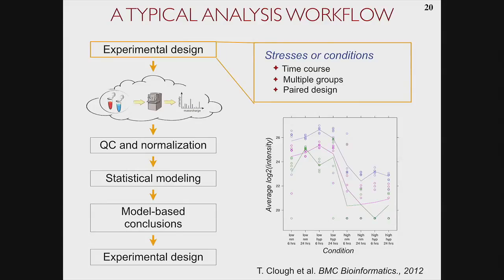And this is the overall run-through of how MSstats works. So, of course, the first important part is the experimental design, right? And before we do anything, we need to actually convince ourselves that we're interested in testing, as opposed to class discovery or class prediction. Because, as we said yesterday, these will be very different statistical methods. So here it is specific to comparing the means of the populations.